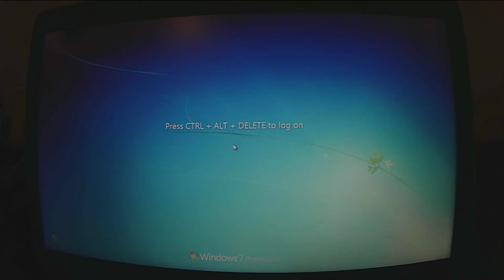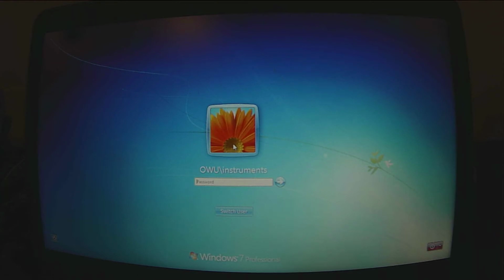So in this video we're going to be processing our IR spectrum and correcting the baseline and labeling peaks and doing some searching to find out what functional groups are present and how we can tell those functional groups are present. So I'm going to go ahead and log into this computer using the chemistry 1114 password.